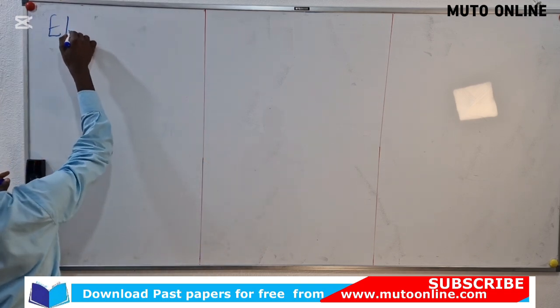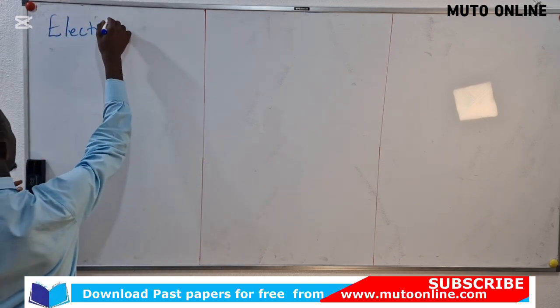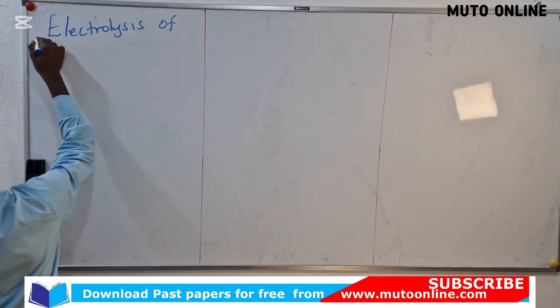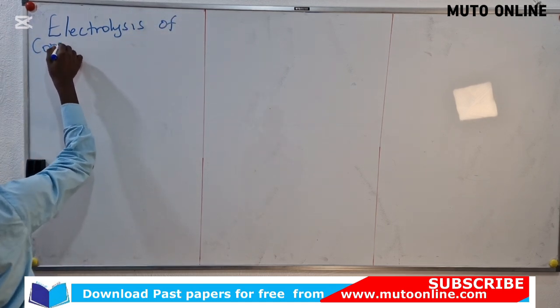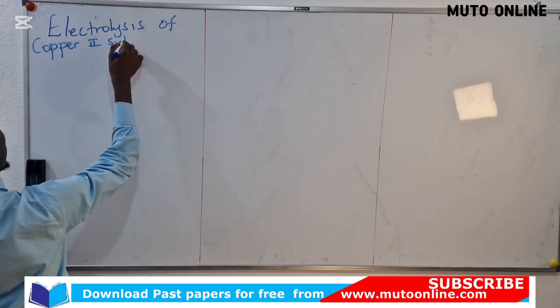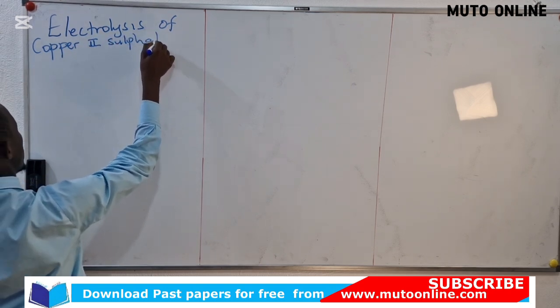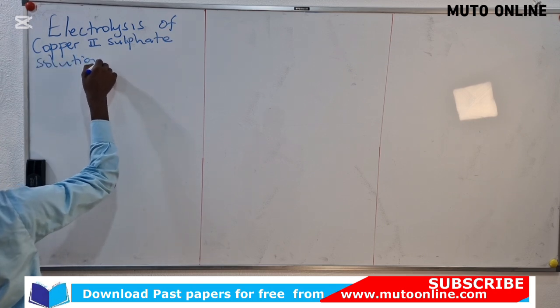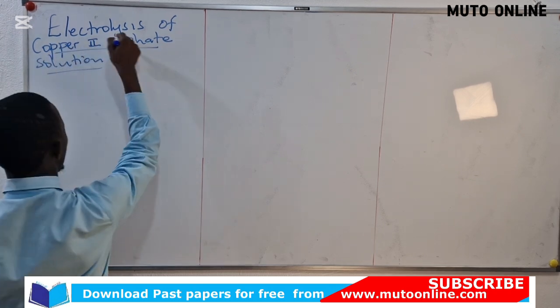copper II sulfate solution as the electrolyte.